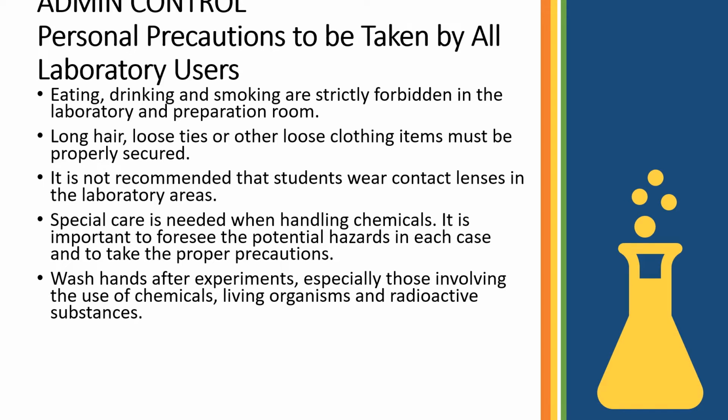Eating, drinking, and smoking are strictly forbidden in the laboratory and preparation room. Long hair, loose ties, or other loose clothing items must be properly secured. It is not recommended that students wear contact lenses in the laboratory areas. Special care is needed when handling chemicals. It is important to foresee the potential hazards in each case and to take the proper precautions. Wash hands after experiments, especially those involving the use of chemicals, living organisms, and radioactive substances.